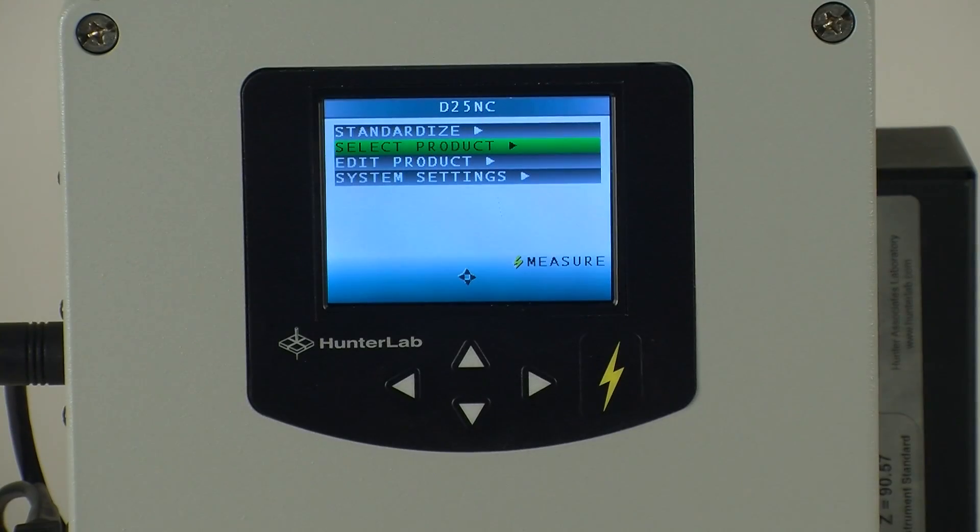Step 1 is to configure your D25NC to the desired color scale, illuminant, and observer, and set the measurement time according to your standard operating procedure.